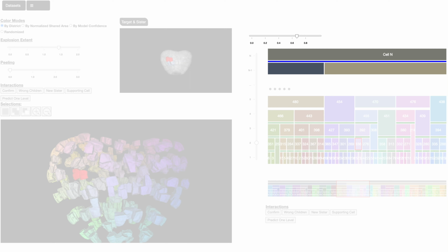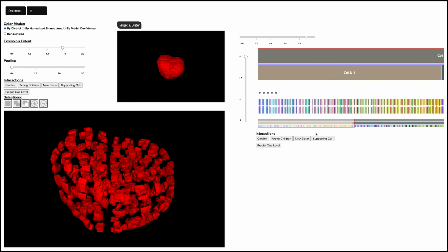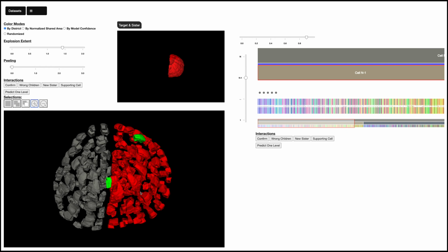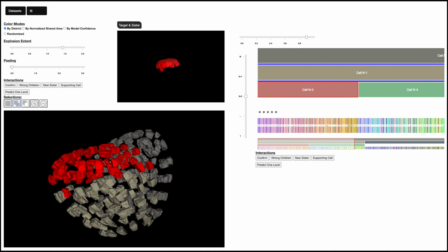Based on their experience, biologists can also reason in a top-down fashion, which we now support in our approach. They divide the embryo into a few stages based on its shape to establish a part of the lineage tree from the top. This process also introduces constraints for the linear classifier, improving its results.